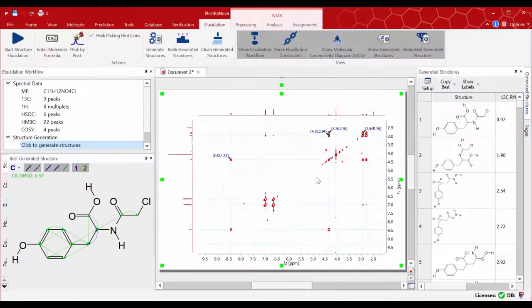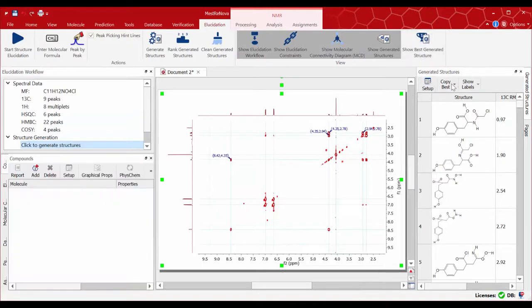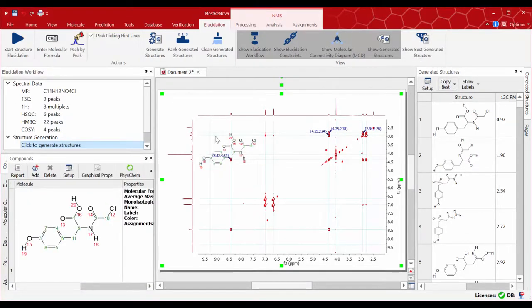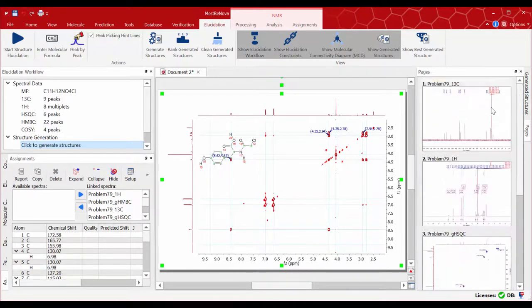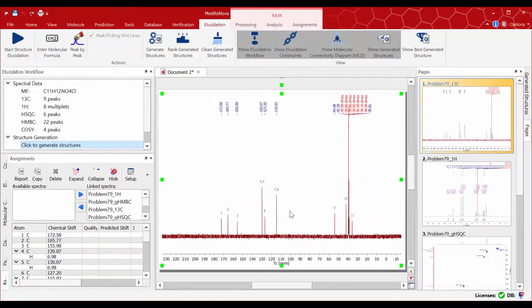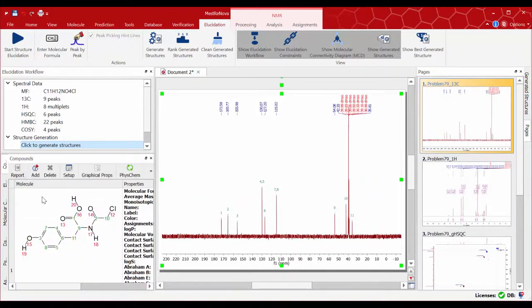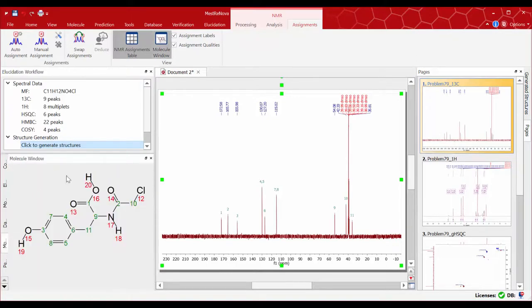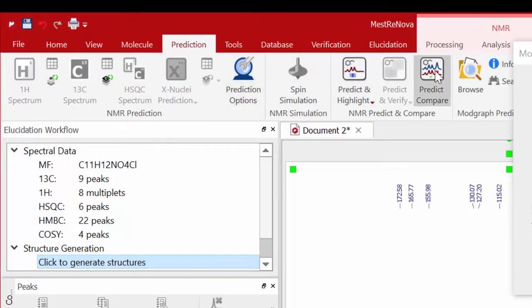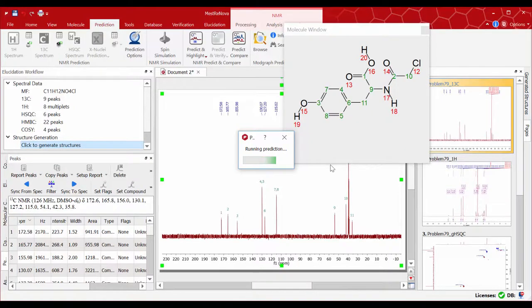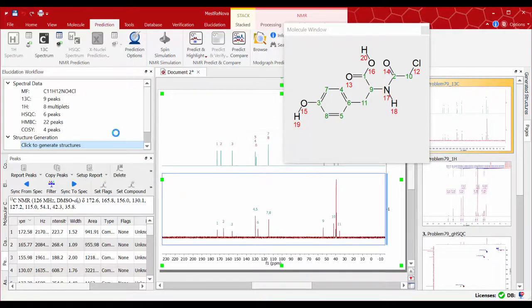Now you can click on 'Copy Best' in the generated structures table, so the best proposed structure with its assignments is sent to the compounds table. On the pages tab, search for your carbon spectrum and under the prediction section select 'Predict and Compare.' In this way you can check how well the predicted carbon-13 shifts match with the best proposed structure.